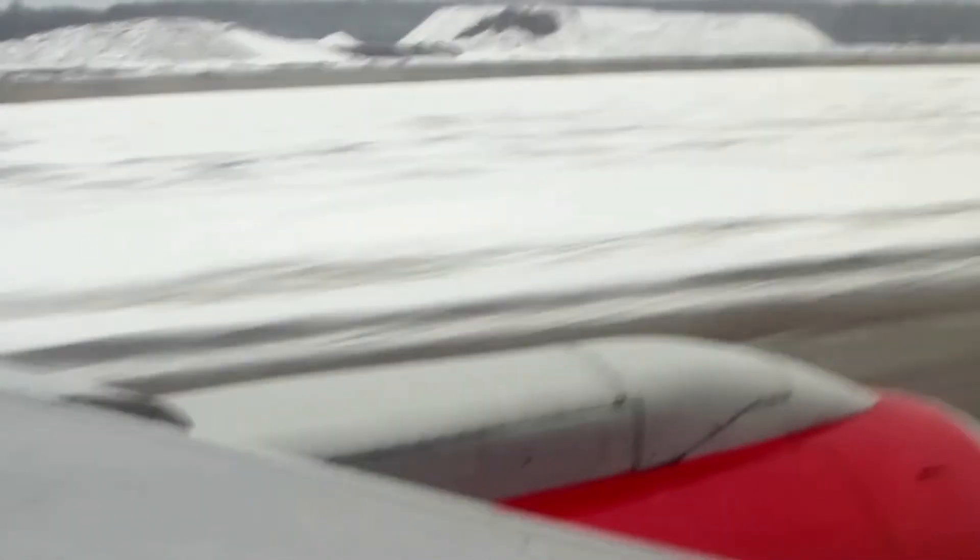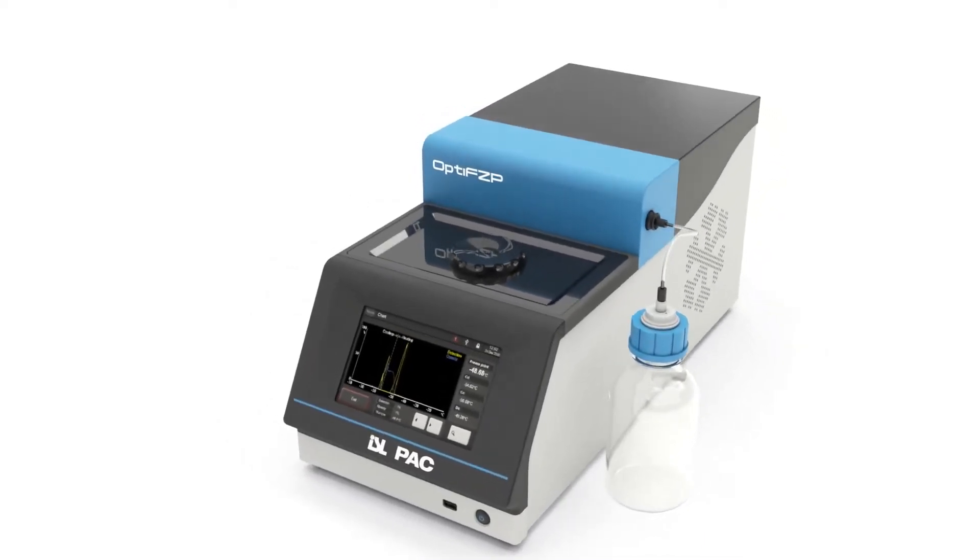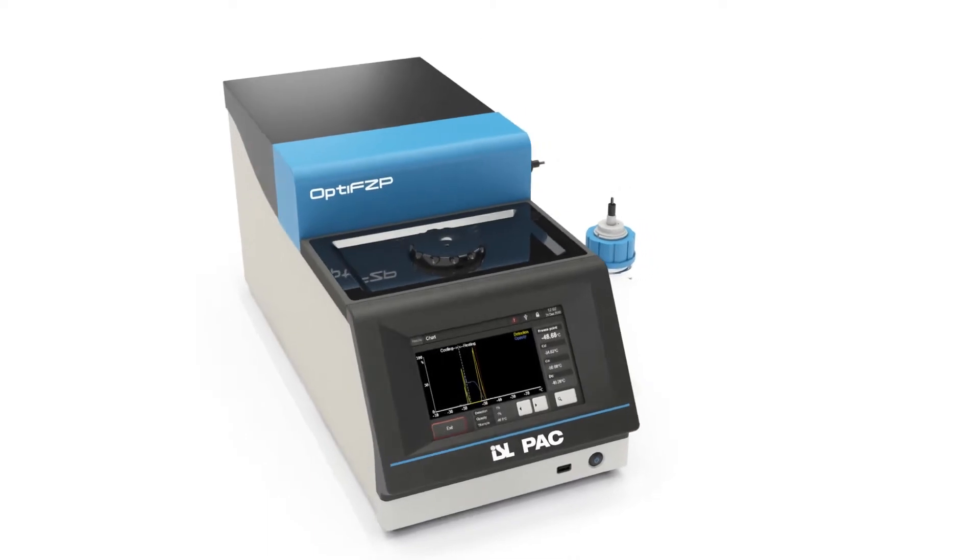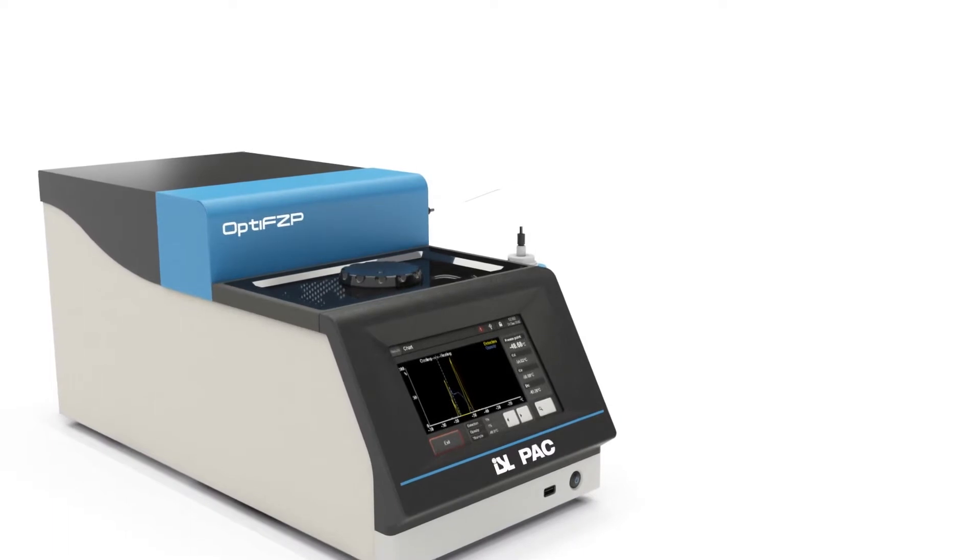These require extremely accurate freezing point measurements to determine and execute flight plans. OPTI-FZP provides a stable and reliable platform that's easy to use, with software that provides real-time results and graphics allowing users to quantitatively and qualitatively evaluate the quality of their jet fuel.